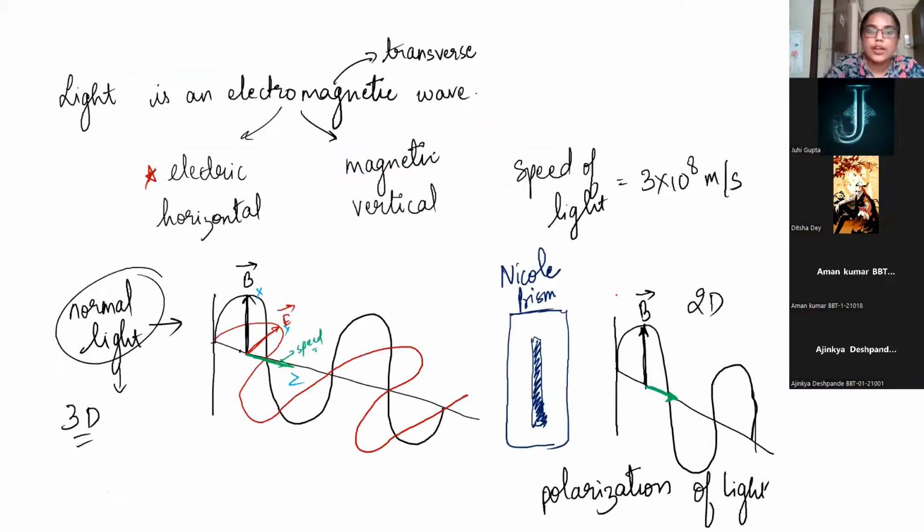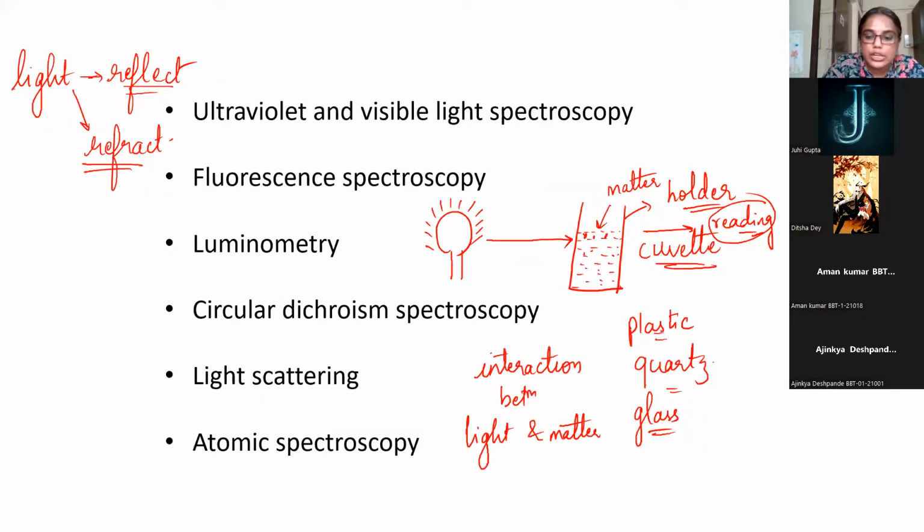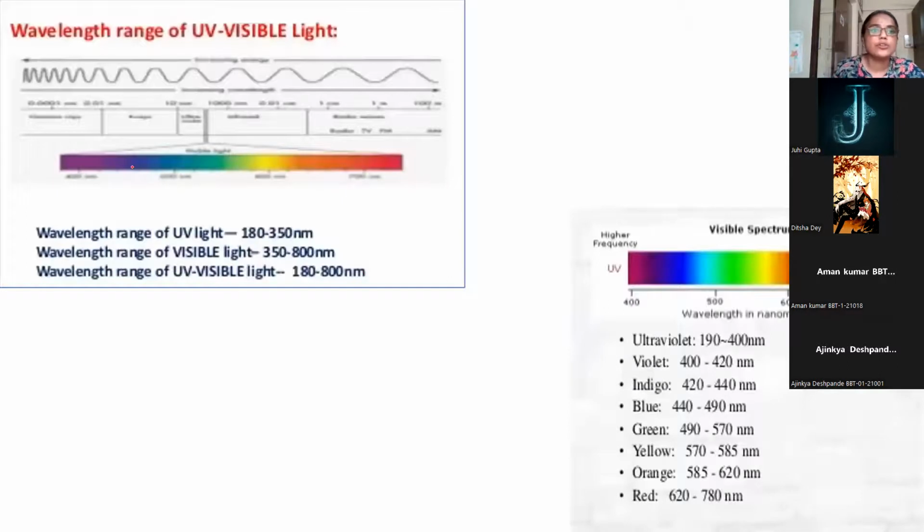Okay, I think I have a slide here which is not very clear. Yeah, so this is how it is. See, this part is the UV, then this becomes the visible, and then this becomes the infrared part. So when you look at the wavelengths of UV visible light, in this band you will see something like this, shorter wavelengths. This is visible. Here you will see longer.